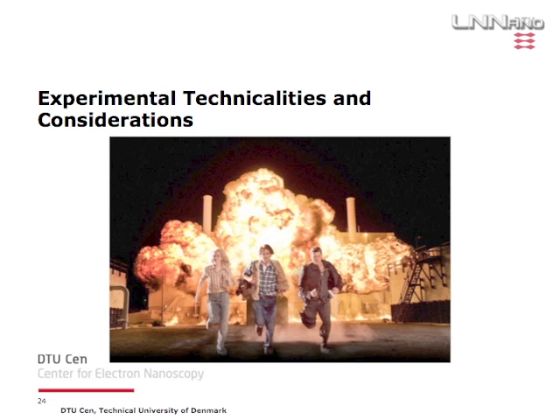So some experimental technicalities and considerations. Some people have already asked me previously if you want to put oxygen and hydrogen in there at the same time, and that's probably a bad idea, even at these low pressures. So you do have to think your experiments through a little bit before you actually carry them out.